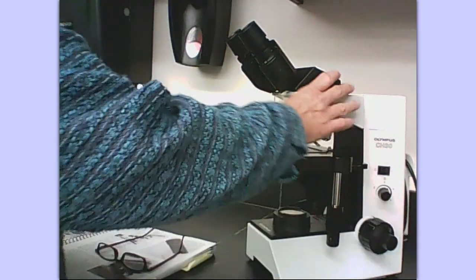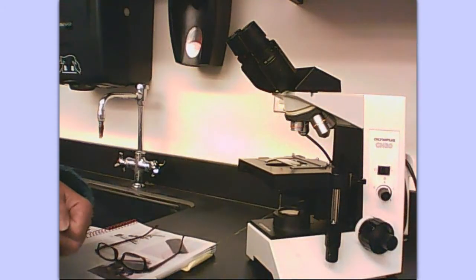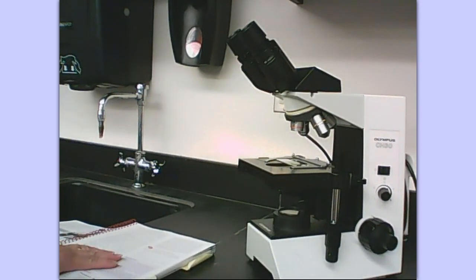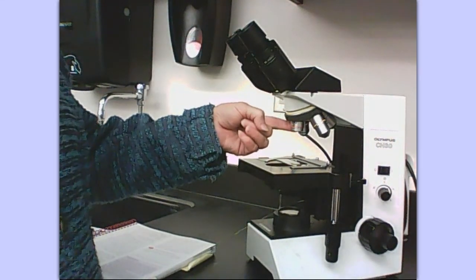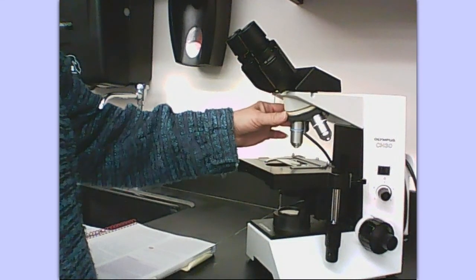As you are finished looking at a slide, don't touch the coarse adjustment knob. Turn the revolving nosepiece back to the scanning objective and then lower your stage. Take the slide off when you're preparing to put the microscope up. Par-focal means that you can go from one objective to the next without having to use the coarse adjustment knob again because it stays pretty much in focus. Total magnification is the eyepiece times the objective: scanning is 4x giving 40x total, low power is 10x giving 100x total, and high power is 40x giving 400x total.